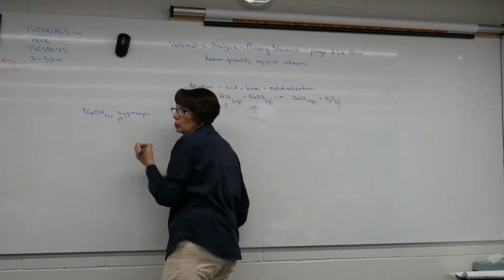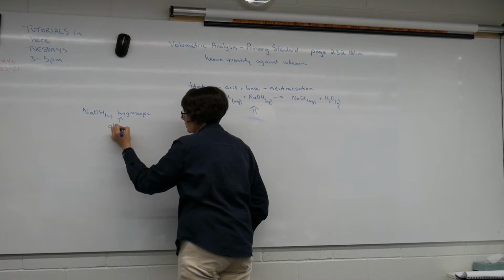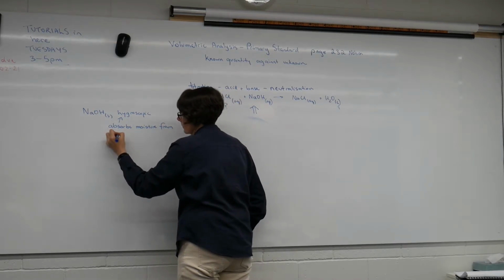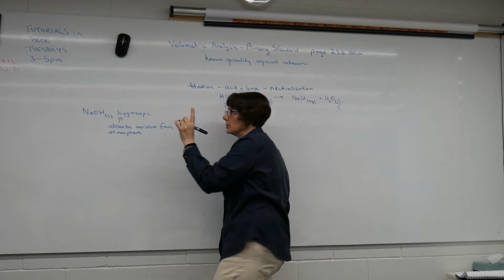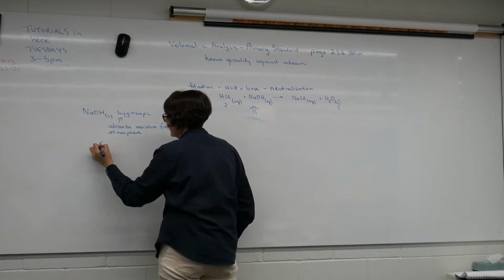It means that it absorbs moisture from the atmosphere. Isn't that what's in your pencil cases and stuff? No, that's silica gel. It's not this, because this is a bit too dangerous to put in there.